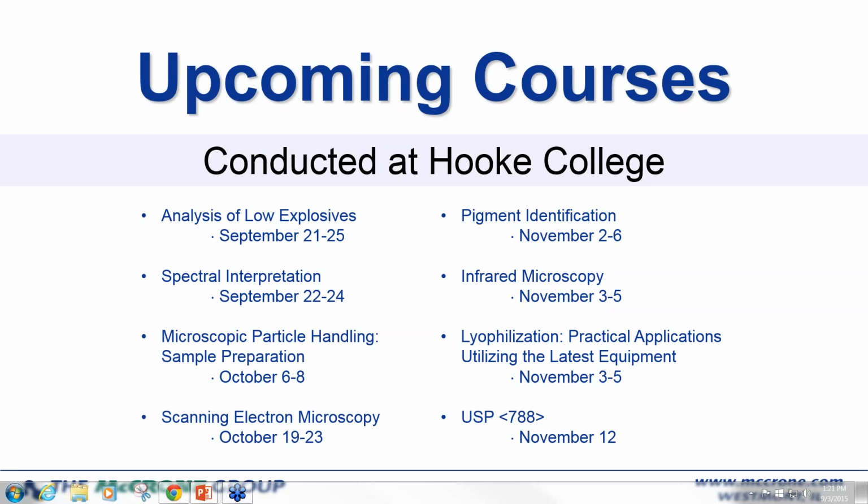If you're looking at a powder for homogeneity, obviously looking at it under the scope first, you're going to be able to pick out the stuff that has some visual differences. ATR pressed down on an inhomogeneous powder, you're going to see a lot of issues with consistent contact throughout the sample. And really the only way to compensate for the fact that the ATR is only looking at a small part of that is to take multiple ATR scans from multiple places.